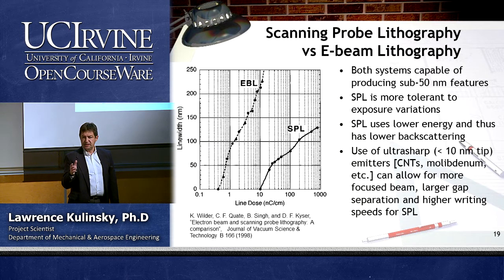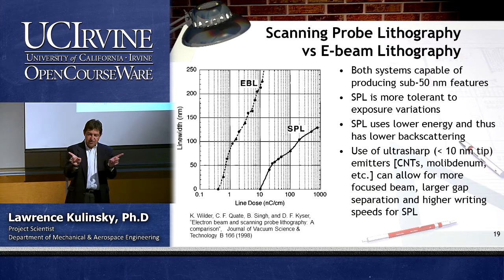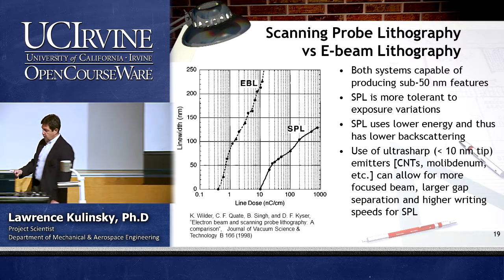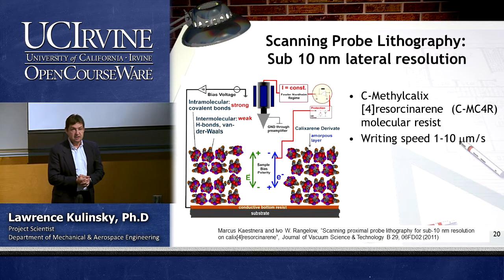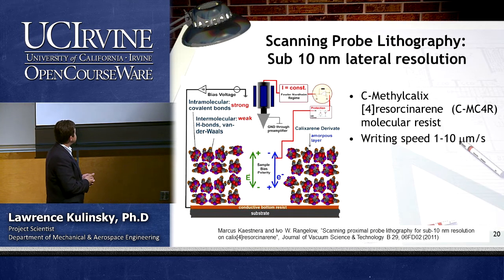One picture I have seen in Professor Madhu's 3 volumes, in the second volume that discusses the topic of proximal probes, is a very nice picture of the proximal probe tip with the nanotube attached to the probe. So you can use a nanotube at the tip of your probe to improve your resolution. We can have less than 10 nanometers lateral resolution. So it's very important.